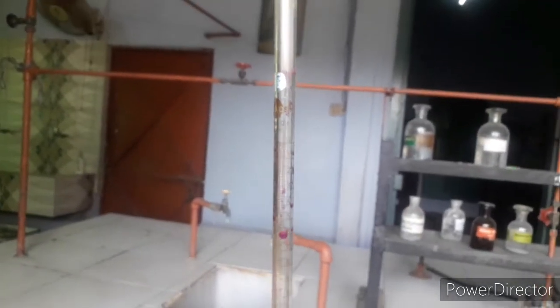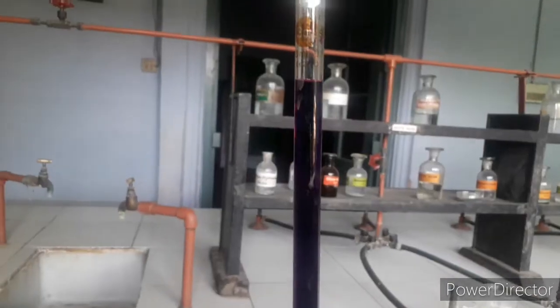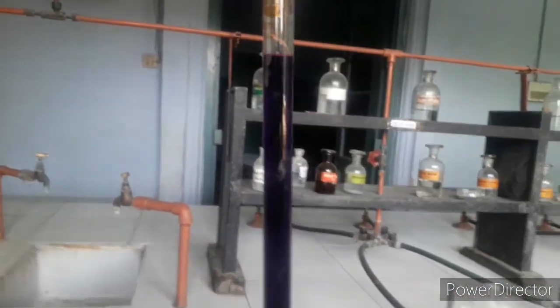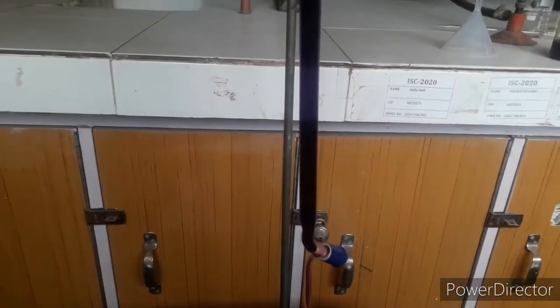Now I'll fill the burette with KMnO4 up to the 0 mark at the top. You can see the burette has been filled to the 0 mark and the knob at the bottom is closed.